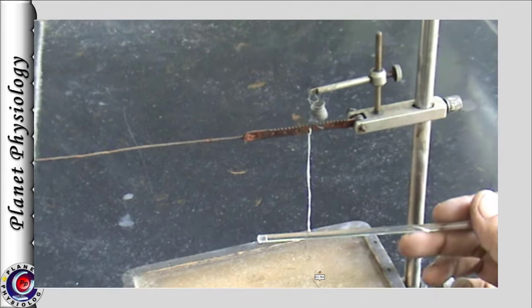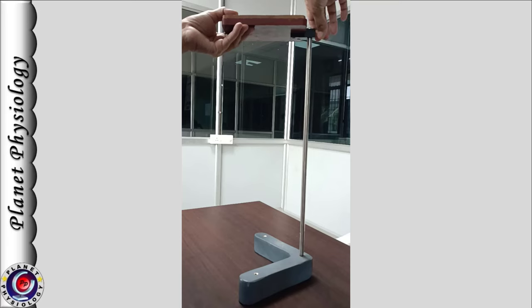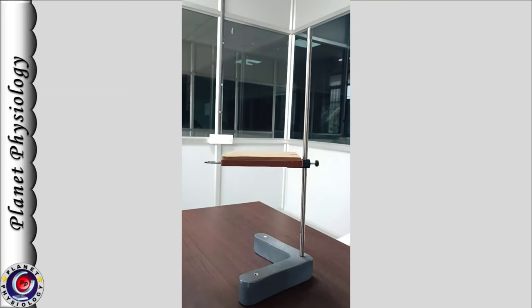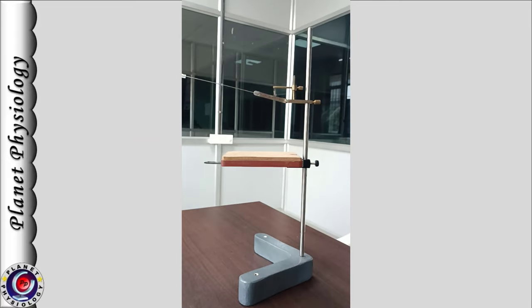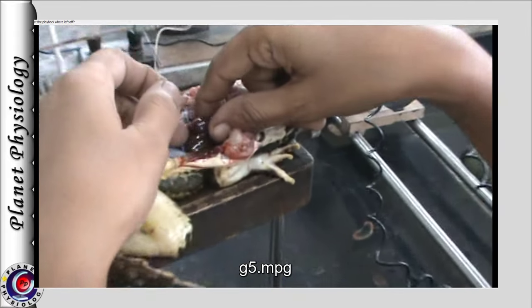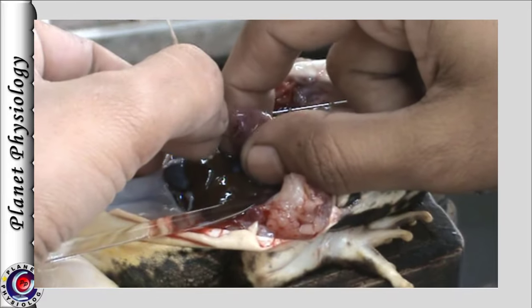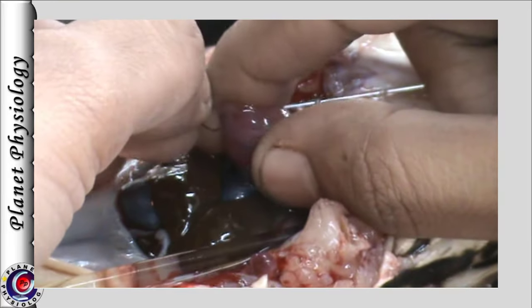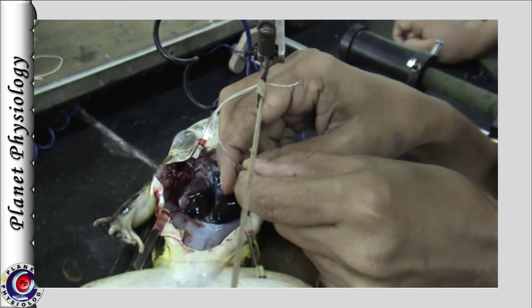As you can note, the hook is inserted into the tip of the ventricle. On the stand, we fix the frog board first and then the heart lever above it as shown here. Once the dissection is done, the frog is placed on the board. The ventricle is gently held between the fingers and the hook is inserted through the tip of the ventricle without piercing the chamber.